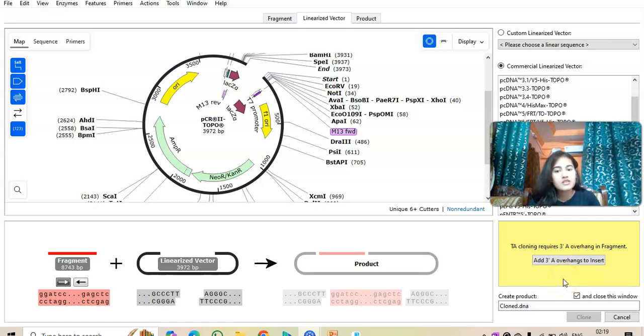Any gene is made up of different nucleotides, and if you are talking about just one or two nucleotides, it becomes a simple task rather than finding a whole section with a restriction enzyme and the specific compatible restriction enzyme if we use the restriction enzyme technique. So it is simpler and you can use it with any gene you want.